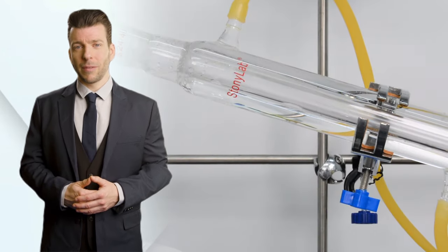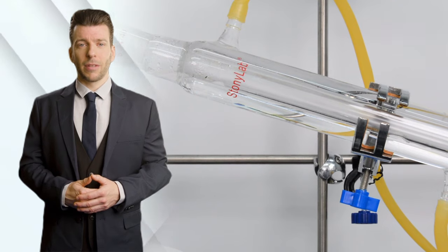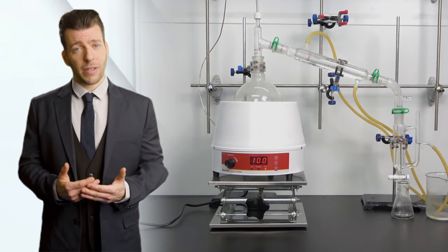These elements typically play a pivotal role in extracting pure products and condensing gaseous substances.